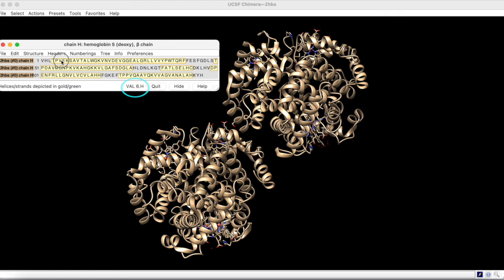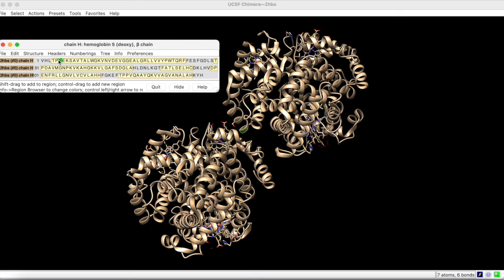To select this residue, click and drag over its letter. Notice the residue highlighted in the graphics window.